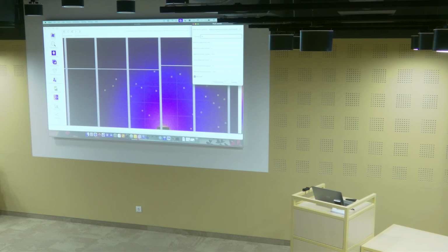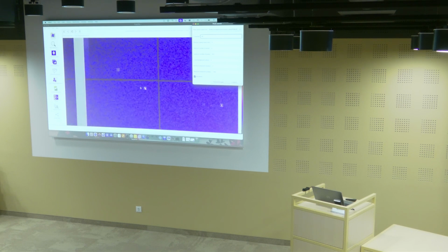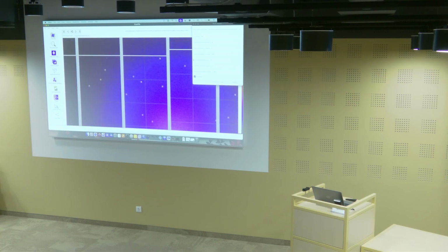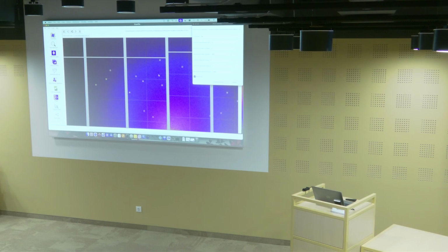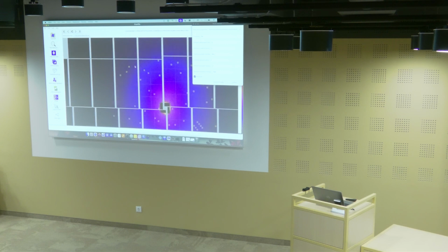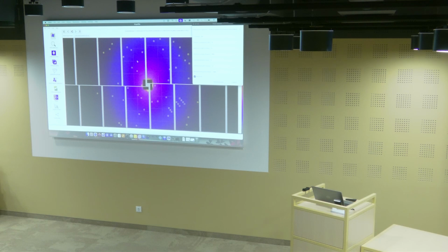Then you have other parameters, such as the minimum amount of pixels that you want to have in your peak. So this is again helping you to prevent selecting a lot of noise. If we zoom in on a peak, we can clearly see that most of the peaks have more than 2 pixels, right? There's a maximum number of pixels, 200. I don't think we will have a peak of more than 200 pixels. As I said, it's not that dramatic to not have selected this peak, for example. The most important thing is that everything that we select is a peak.